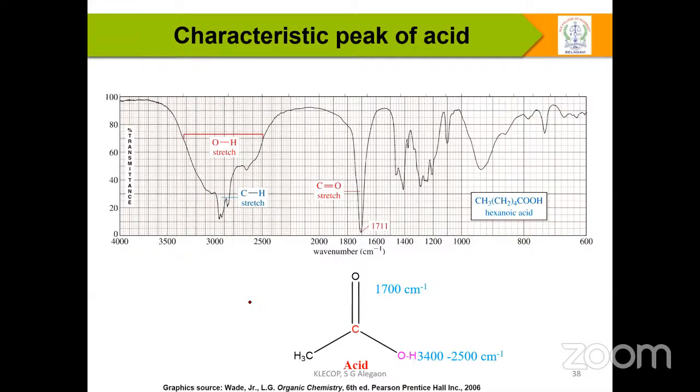But whatever the aldehyde, ketone and carboxylic acid, when you have taken the standard condition, at that time you are going to observe somewhere around 1720 to 1711 reciprocal centimeter. But if you take it in a regular condition, or sometimes a moisture condition, in a normal condition, most of the time these aldehyde, ketone and carboxylic acid, we are going to get a little bit on the lower side, up to 1680 reciprocal centimeter, like 1720 to 1680 reciprocal centimeter, what we observed in most of the practical conditions.